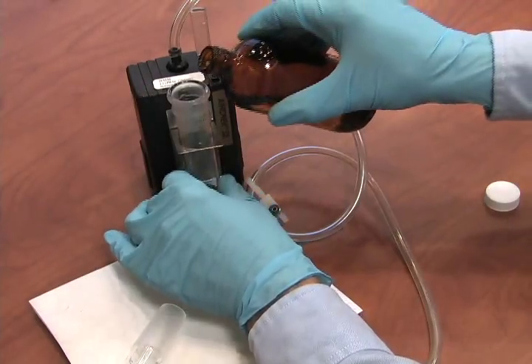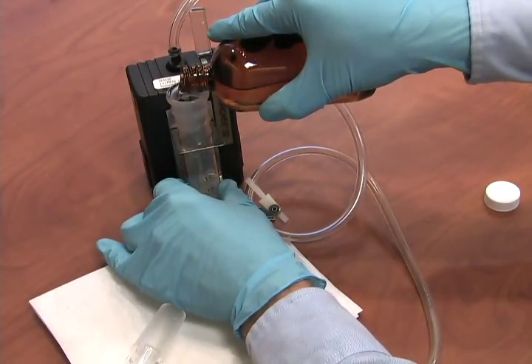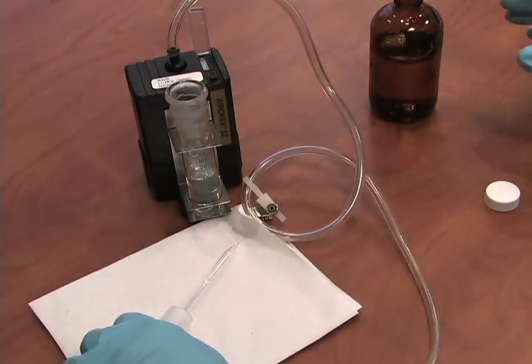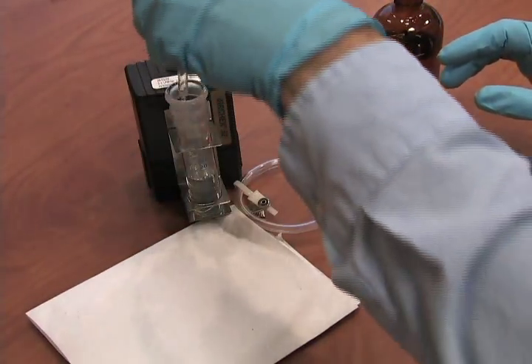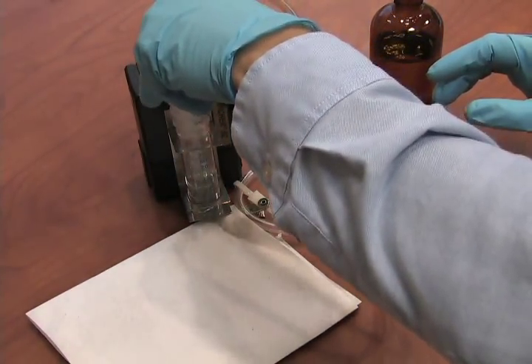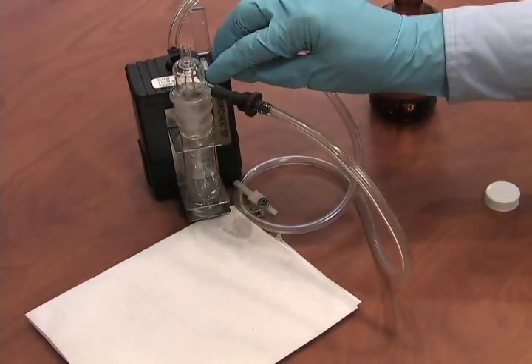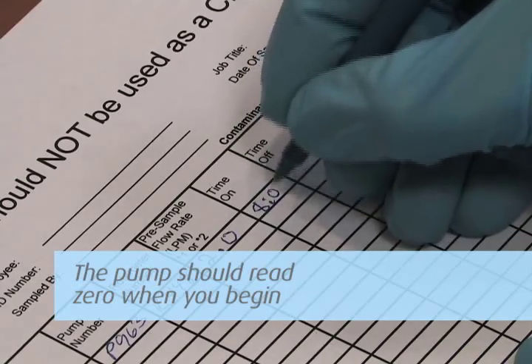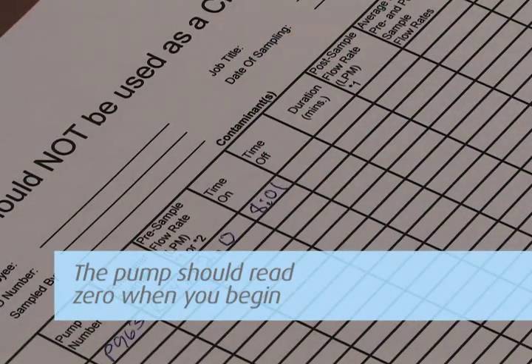Cap and mark the vial for post calibration. Now you can return the impinger to the holder, dispense the proper amount of solution to sample, and reinstall the tubing. Turn on the pump and record the time to the minute that the pump was started. The counter records the number of minutes the pump is operating and should read zero when you begin.